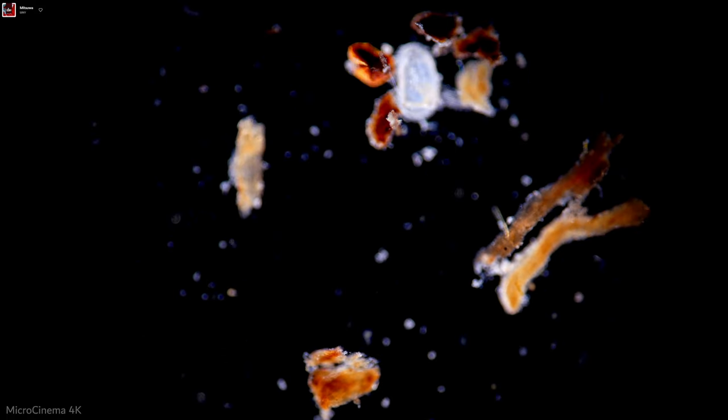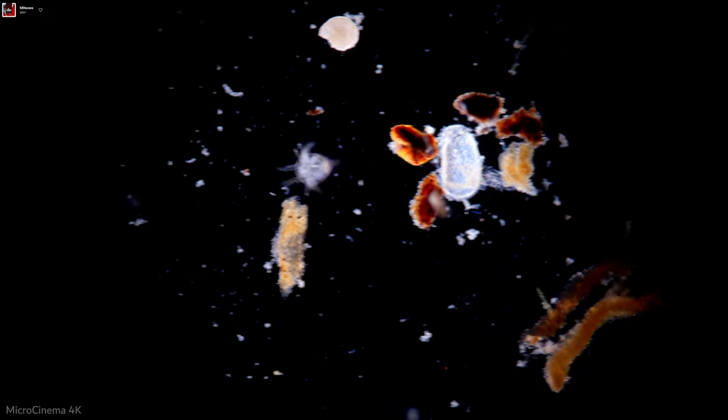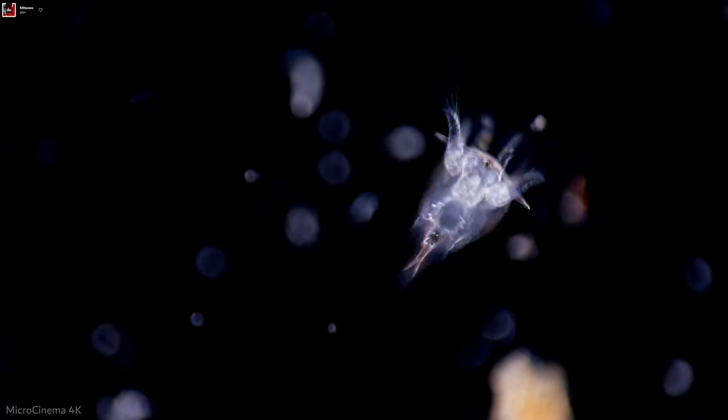And so that's what's in this well. And then we can go over to this well and we'll see how this one's doing here. So this is actually, hey, look at that. Hey, we got a plankton. It's not dead. It's alive. So I made this slide somewhat differently than the other one that we had much less success with in terms of getting living organisms to look at. Yeah, look at that. We got a little zooplankton.